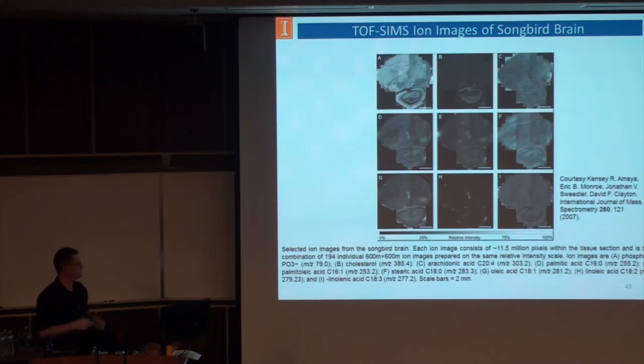I'm not a brain scientist, so I don't quite know where all those are. But this localization increases after post-hatch day 40. What was funny about this was he needed a very big area scan, and so what he ended up doing was taking individual 600 by 600 micron scans and slightly overlapping them and doing a whole map across the surface. And then he went over to Beckman and the Imaging and Visualization Center and was able to stitch them together.